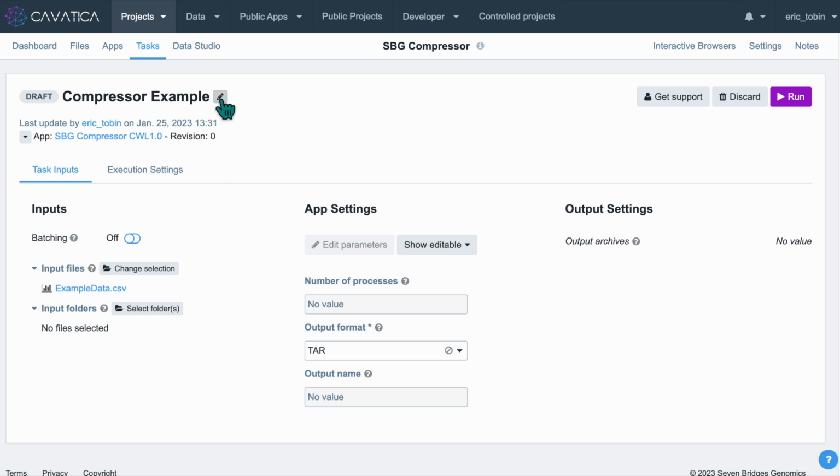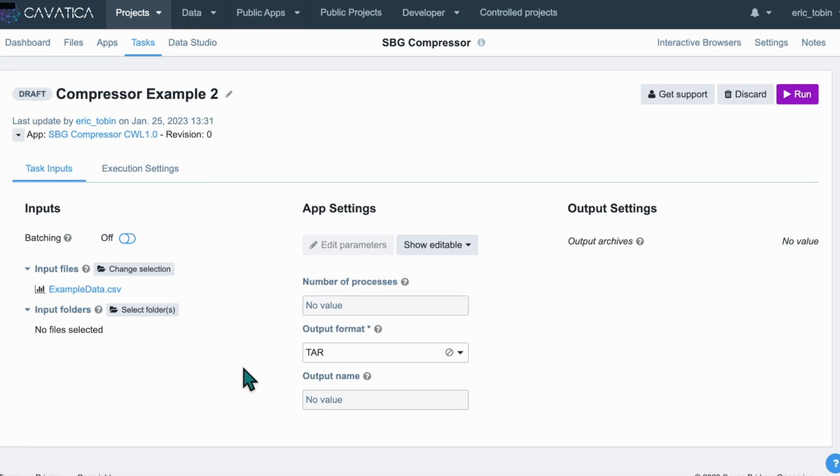And then you can edit this for however you need to rerun the task. This one worked, but in an instance where a task might have failed and you realize it was a parameter setting, you can go back after you've set the task up, change things to comply, and run again. This is where memoization comes in, because those intermediate files you might have produced in a failed task, the task will pick up immediately from that step, so it does not waste time or money recomputing those available values.